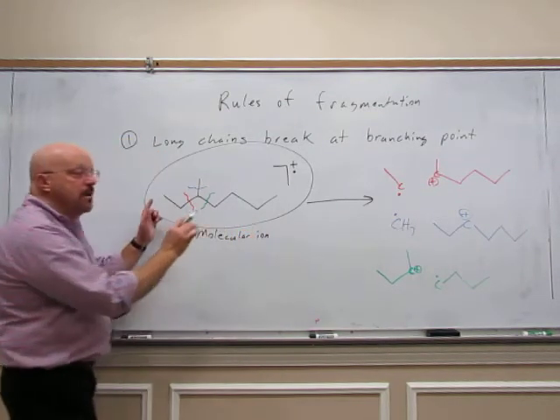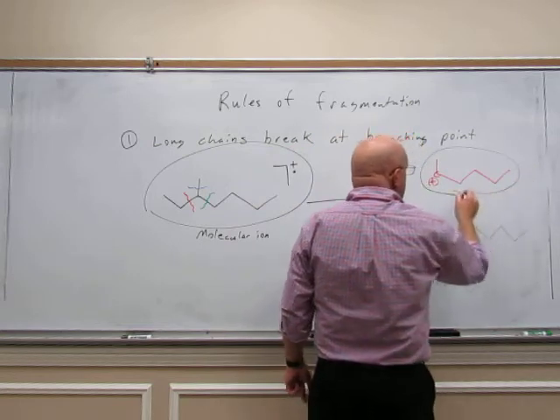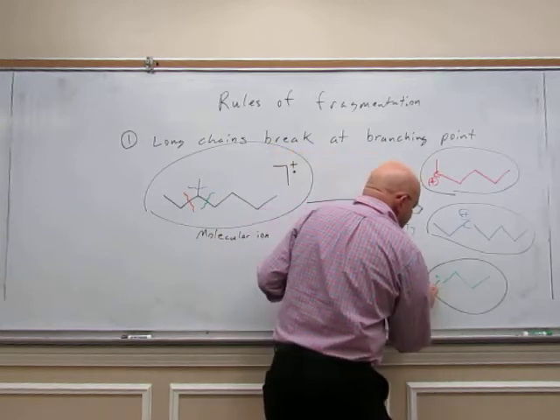That's where all we did was knock an electron out. So I'll see a peak for that. I will see a peak for this cation. I will see a peak for this cation. And we see a peak for this cation. Whoops, sorry. I circled wrong.